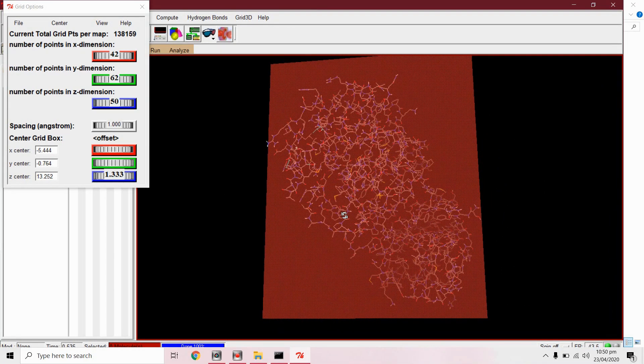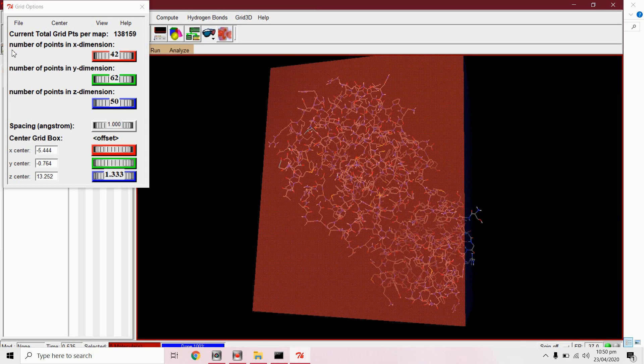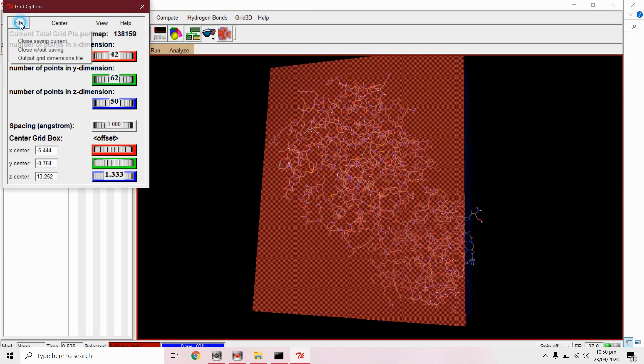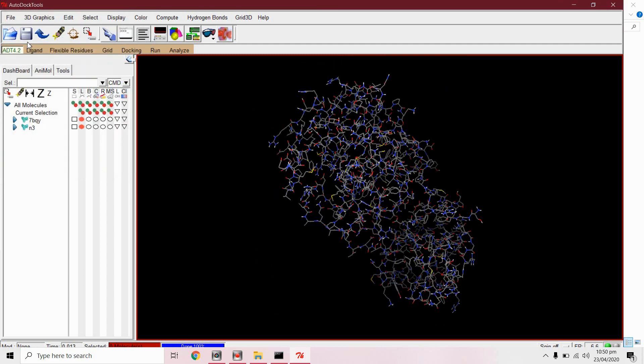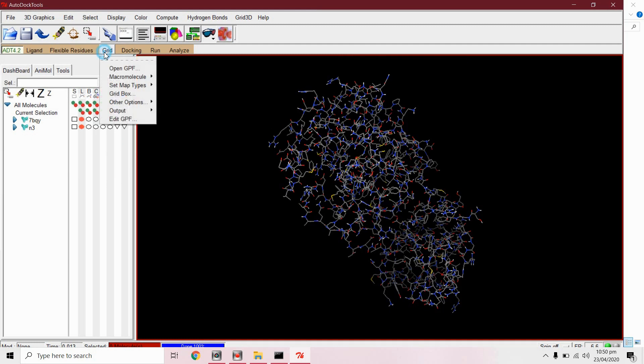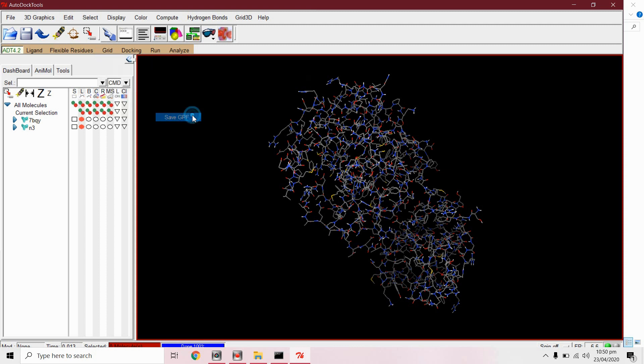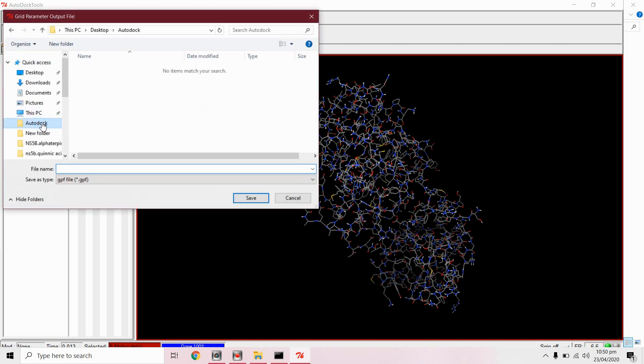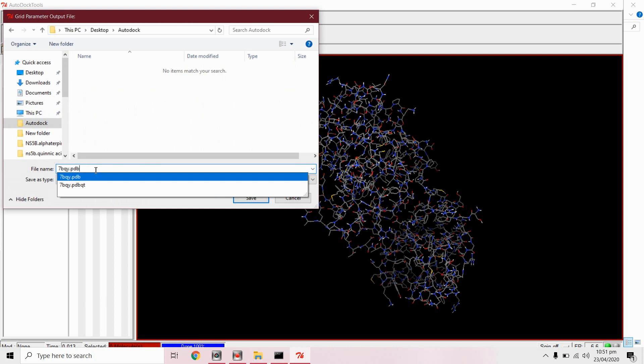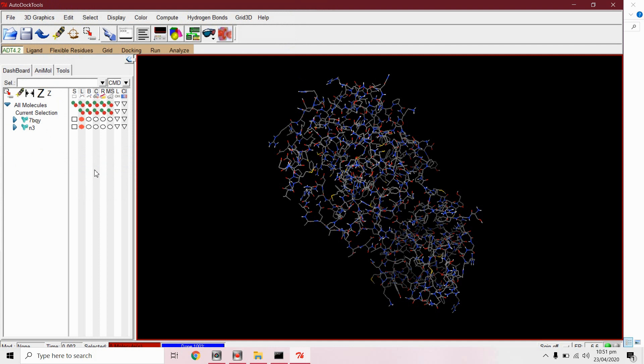We will go with these parameters from files close saving grant. Now from grid output save as GPF file format.